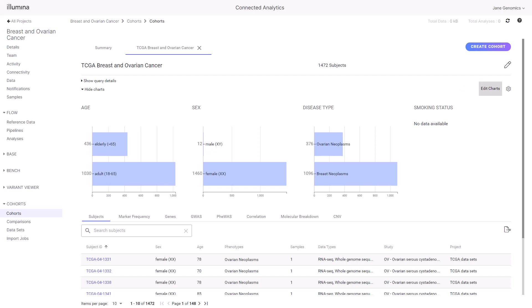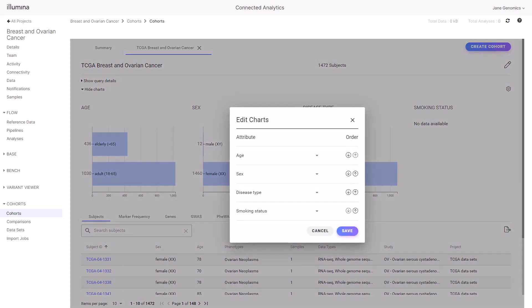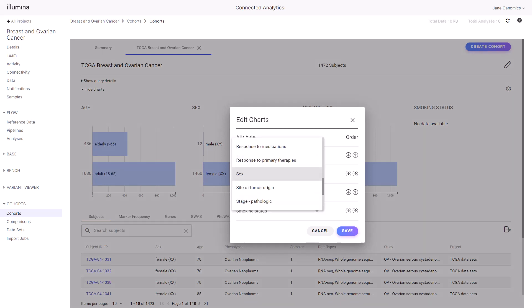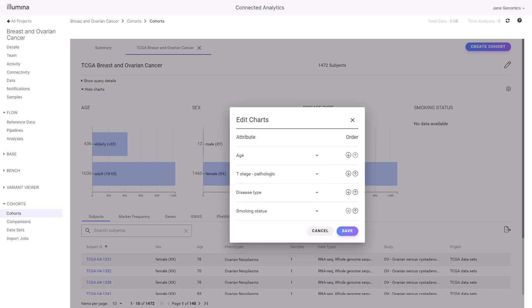Select Edit to customize the clinical attributes of choice. Let's set the attributes to TNM staging, which is a system used to classify cancer and help determine best treatments. T-stage pathologic describes the size and extent of the primary tumor.